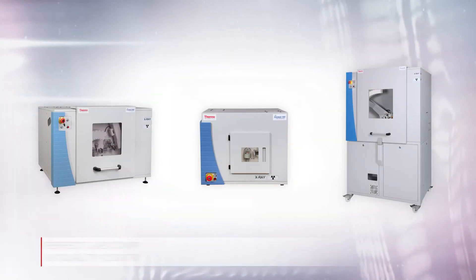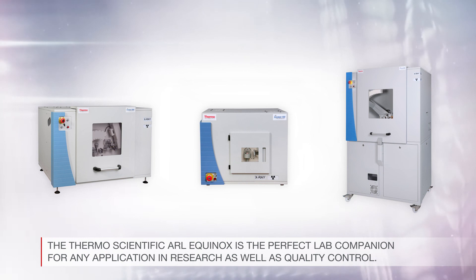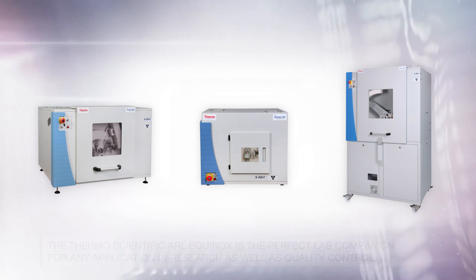The Thermo Scientific ARL Equinox is the perfect lab companion for any application in research as well as quality control. It also conforms to requirements in regulated environments.